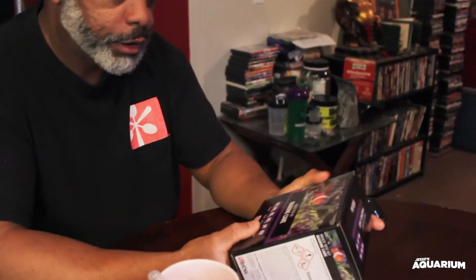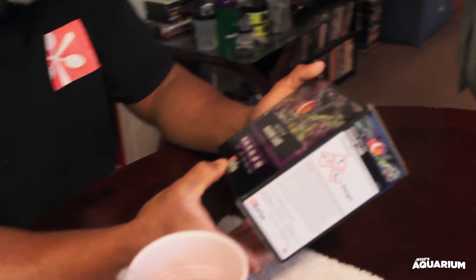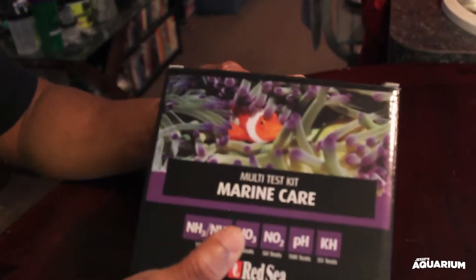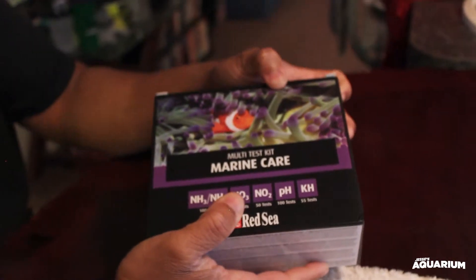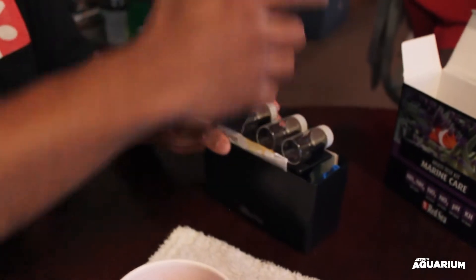Alright, now we're going to check out the Red Sea Marine Care Multi Test Kit, see how this one works and how it compares to the API test kit. I've never used one of Red Sea's test kits, so we'll see what we get.